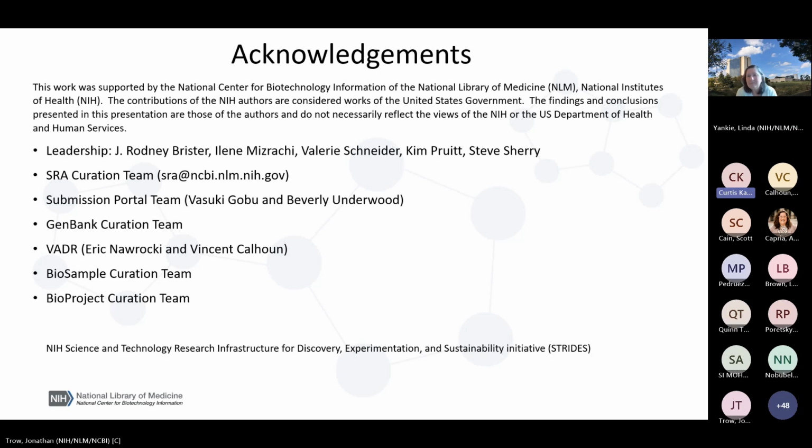Thank you so much. I'm just curious if the web-based submission portal will be able to handle flu samples where not all segments are present. Sometimes that happens where a segment doesn't get sequenced. The automatic flu annotation pipeline that is currently available will accept samples where not all 8 segments are present.